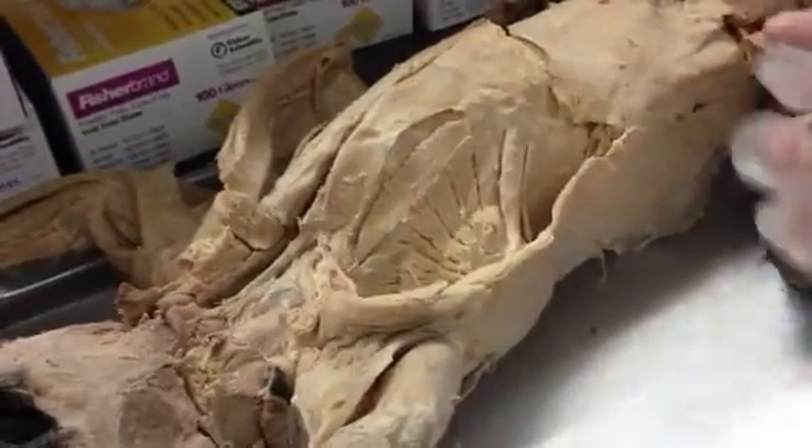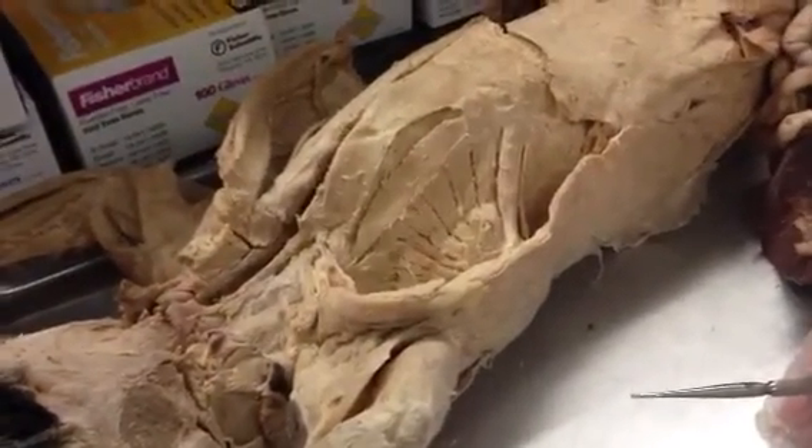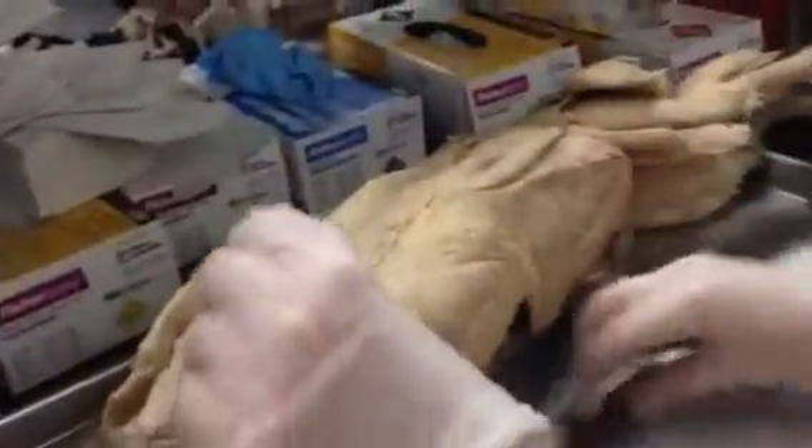If you write scalenus but write the wrong one, you'll get half credit. Also in that group is the levator scapulae, which you have to turn over the cat to see.